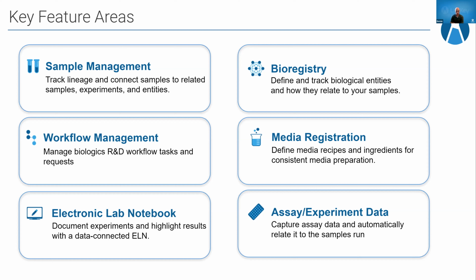This account manager will work with you to understand the way that you currently store and manage your data, and will help you model it in useful ways within our system. So there's an exchange of information, there's some experimentation and show and tell. We work up a plan for getting all of your data structures designed, and start getting data into them.